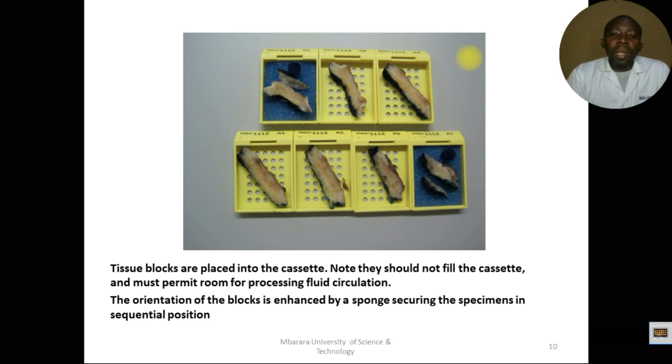So the pathologist here who was grossing at the station identified certain portions or certain parts on the tissue, and then cut out small parts of the tissue. And when we look at this tissue, this tissue is even marked with ink. We are seeing black, something appearing like black. I think it was actually marking out the margins.